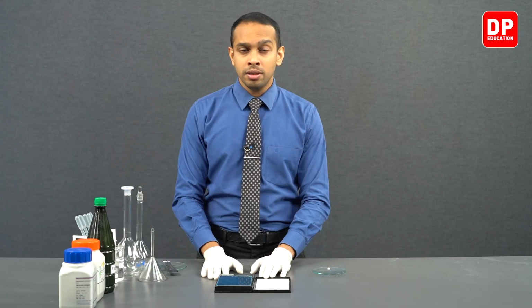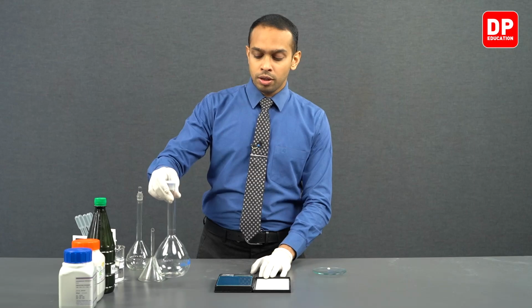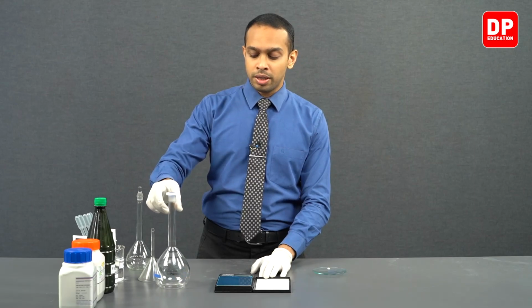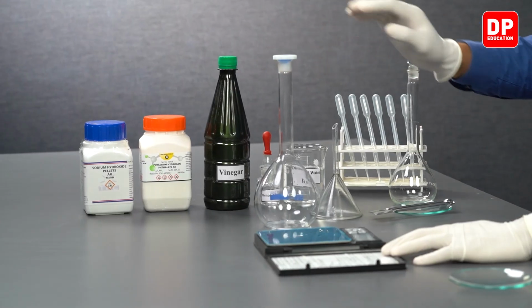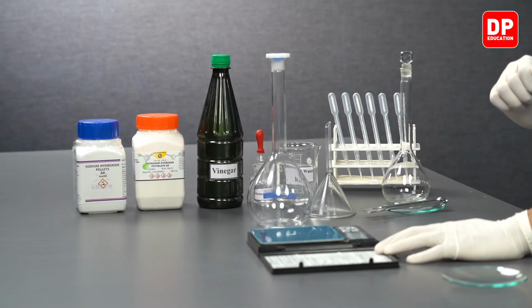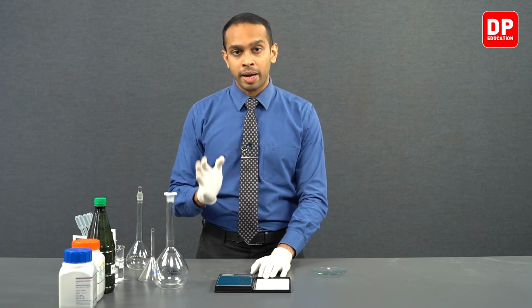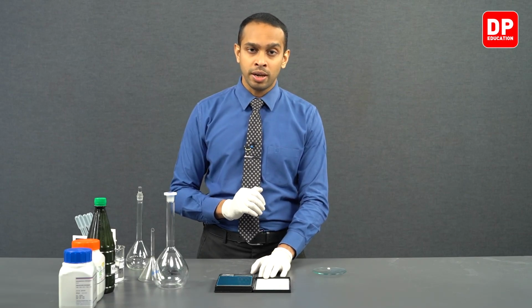We need to prepare a 0.2 moles per decimeter cube concentrated sodium hydroxide solution. We are going to be using a 500 milliliter volumetric flask to prepare our sodium hydroxide solution, and we do know the molecular mass of sodium hydroxide.